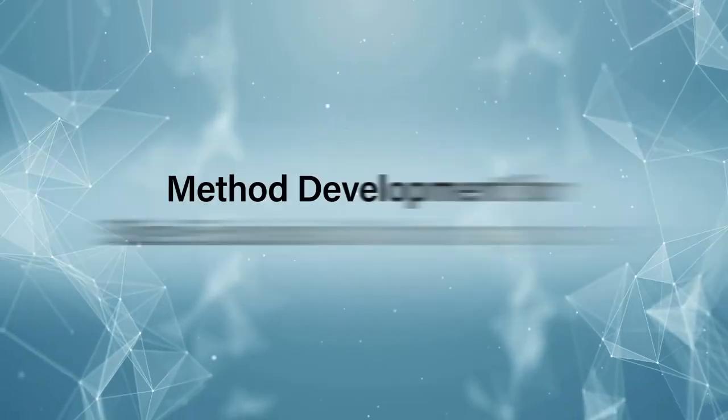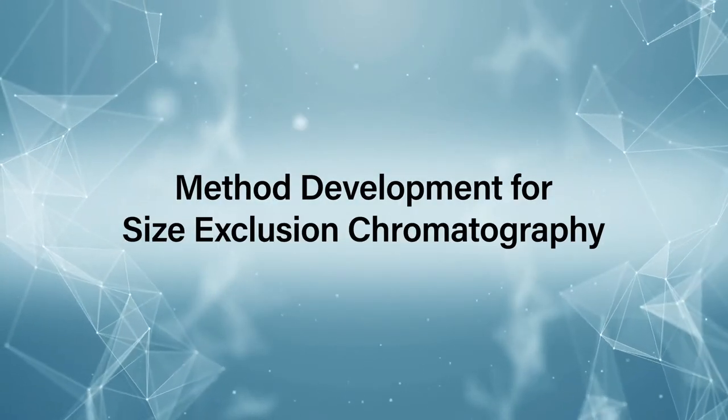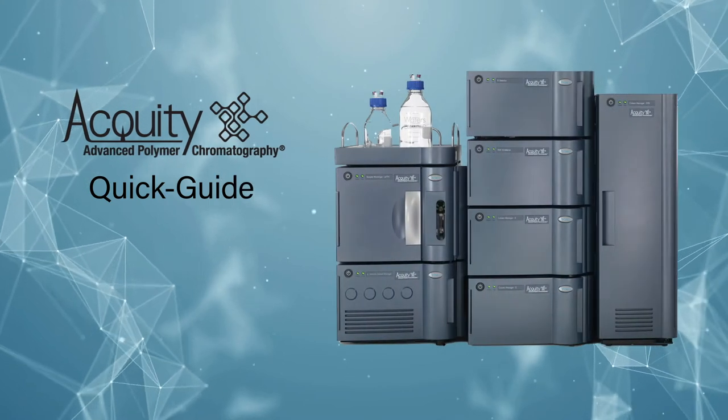Hello, I'm Ben McCreath, and today I'll be talking about developing your methodology for size exclusion chromatography on the Acquity APC system.